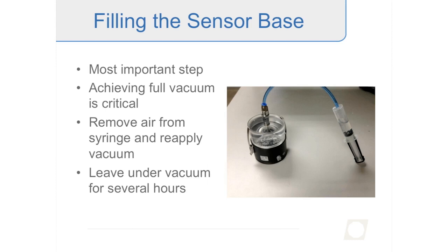After removing air bubbles and reapplying vacuum a few times, you should see readings like 879 hectopascals in the software — which at our elevation is close to full vacuum. That's what allows really good degassing of the water and extends the measurement range. Just like with the tensiometer shafts, it's good to leave the sensor base under vacuum for several hours — I typically recommend starting in the afternoon and leaving it overnight.